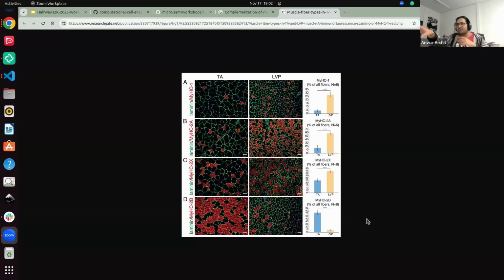We want to see the same field of view as the one on our screen over here, which is to look at the cells very carefully, a bit closer, and this is what the tiling-based prediction does. It zooms in on one frame, takes a tile of say 512 times 512, segments this, goes to the next tile, goes to the next tile, stitches them back together. That's the idea. For this one, you have to do this in 2 stages, which is something I mentioned.